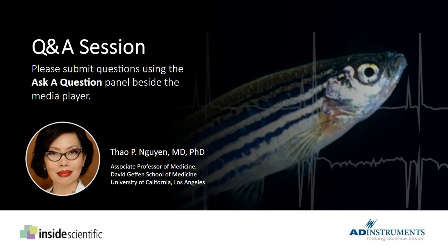Oh, very good question. A short answer is the webinar is focused on, as I said in the disclaimer earlier, a short ECG session, not more than 20 minutes. With a short ECG session, we think we can get by with not having to do anything much extra.